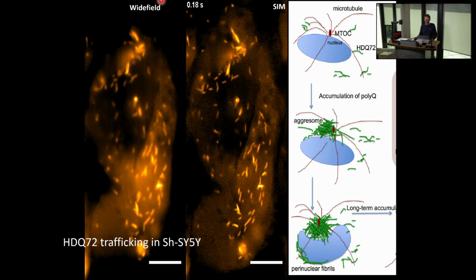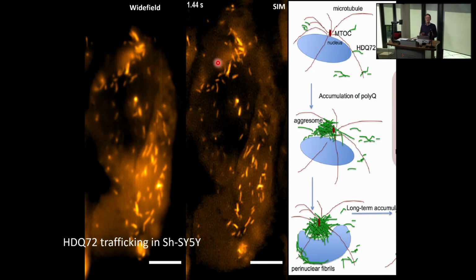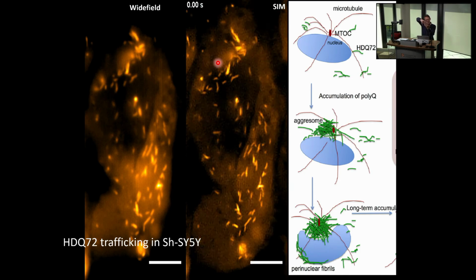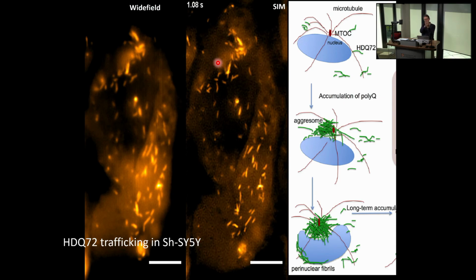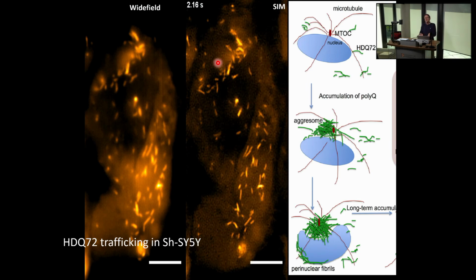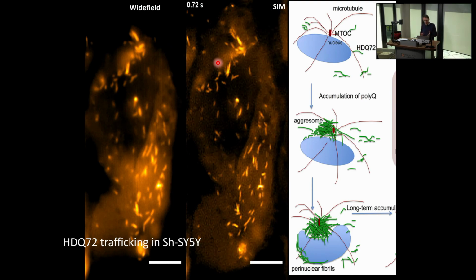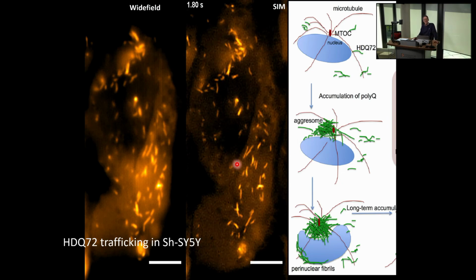And finally, it is truly a live cell imaging technique because it's so fast. So here you really have seconds, and you'll be taking maybe 200 frames a second with our cameras to expose at different phases, different orientations very quickly, and then we take corresponding images for all these orientations and phase shifts, and then we record. We take the data sets and we run them through these SIM algorithms, and then you can actually see how inside the cell things are massively dynamic.